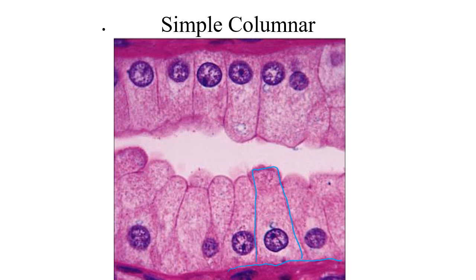With simple columnar epithelium, this particular one that we have here is non-ciliated. So there's no cilia on those cells, but we may have ciliated varieties as well, which are going to have, switching over to purple here, little fingers that actually stick up from the cells. All of those little ciliated components are going to change the location for the tissues themselves. It's going to change where we find the types of tissues within the body, based upon whether we have simple or ciliated or non-ciliated varieties.